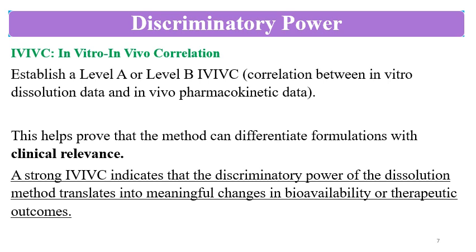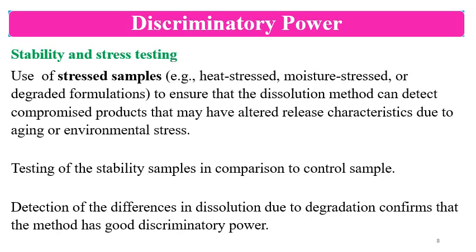A strong IVIVC indicates that the discriminatory power of the dissolution method translates into meaningful changes in the bioavailability or therapeutic outcome. Mainly you should consider the percent release versus the AUC and versus the Cmax. Also you can consider Tmax versus the dissolution rate. So IVIVC can give you a good idea.